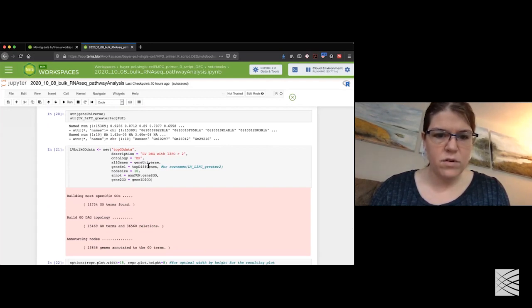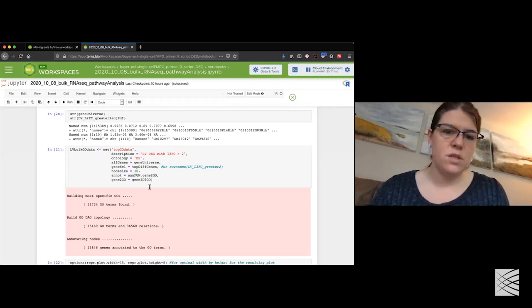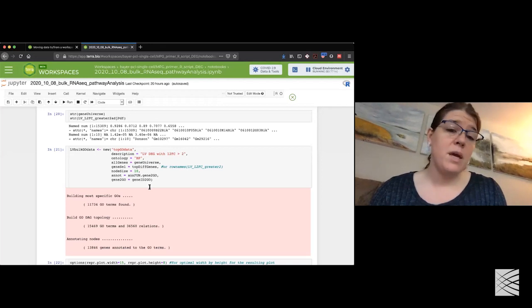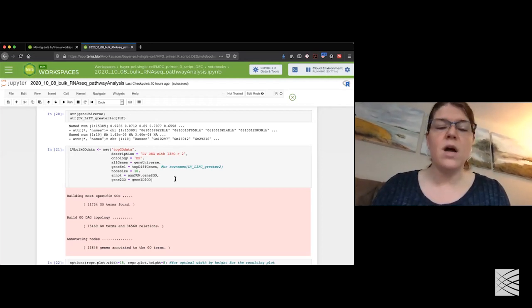We're giving it the gene universe, and we're saying find the top differentially expressed genes. I'm giving it specifically the Benjamini-Hochberg adjusted p-value when it works through this object, and basically letting it do its own selection. But you can delineate your own selection mechanisms as well. What they recommended you hand it was the gene name and some p-value. I chose a somewhat aggressive adjusted p-value for your total results table from DESeq2. But obviously you could filter this.